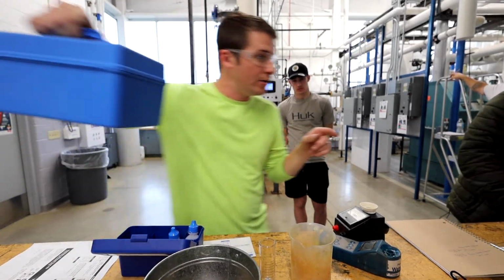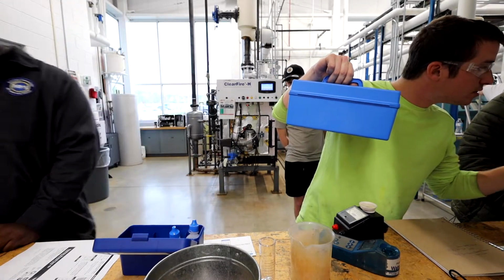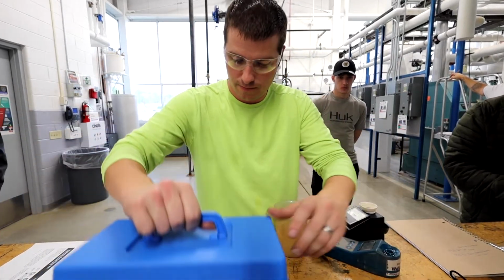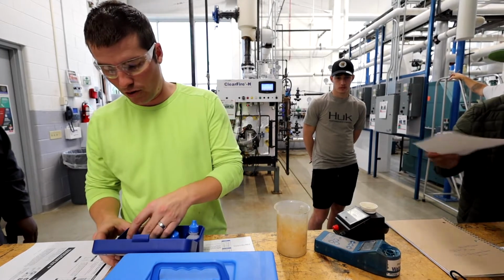So let's grab the iron instructions. One of these. Yep, perfect. All right. So eventually you're gonna run the P or the... Yeah, in the boiler we will. Okay.